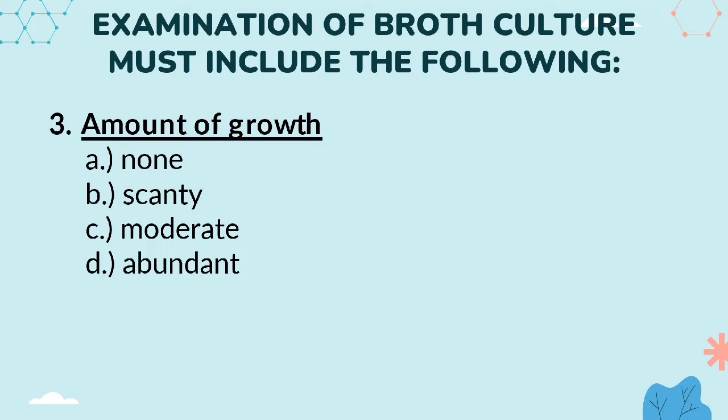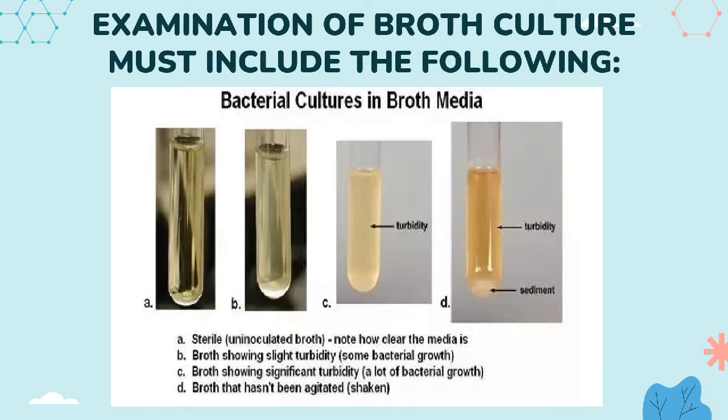Third, the amount of growth. None means no growth may be seen. Scanty means small or insufficient quantity. Moderate means average amount of growth. Abundant means large in quantity. Here's a sample image of bacterial cultures in broth media, wherein A is none or no growth, B is scanty, C is moderate, and D is abundant.